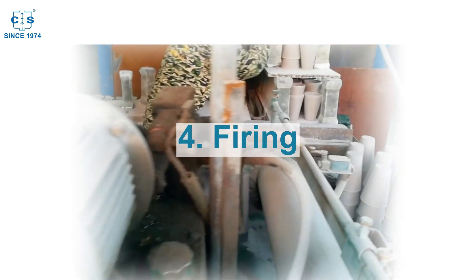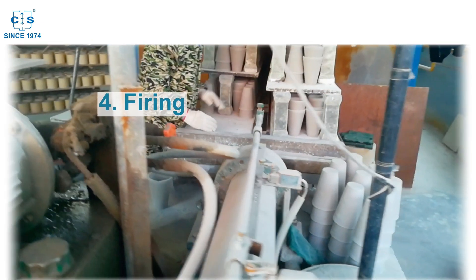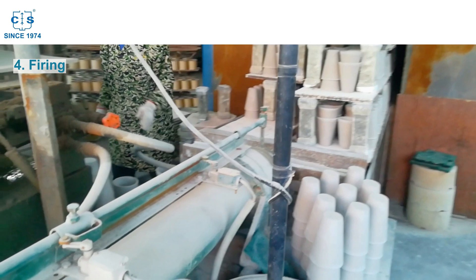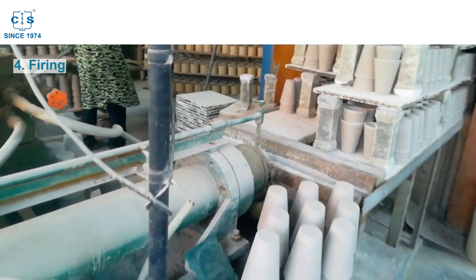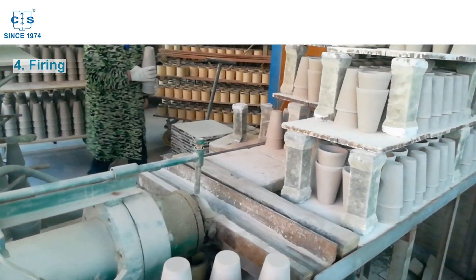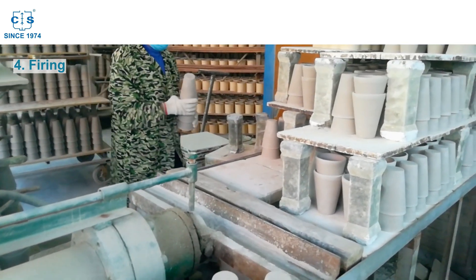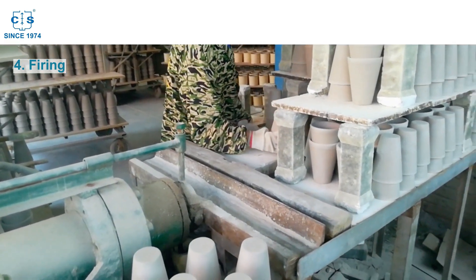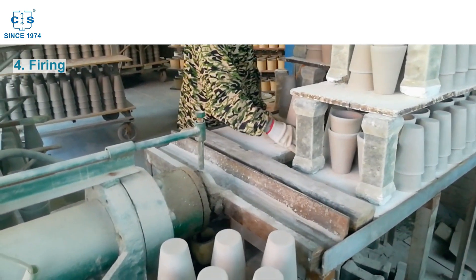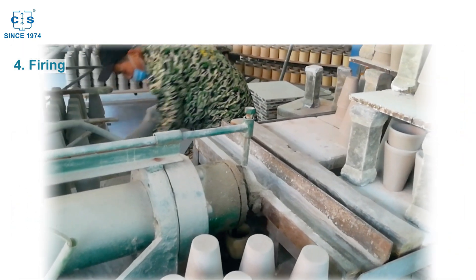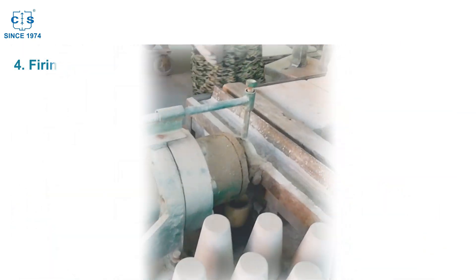Last, firing. The next step in the manufacturing process is firing, where the mold is heated to a high temperature to harden the refractory material and remove any remaining moisture. The firing temperature and duration depend on the type of crucible and the materials used.